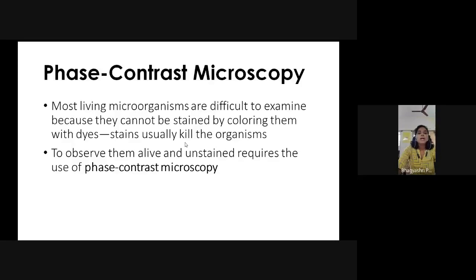In gram staining, the primary stain used is crystal violet, right? The procedure goes like this: first heat fix the culture on the slide, then apply your primary stain, and allow the primary stain to react with the organisms for some time. But if you apply more and more crystal violet, it turns toxic for the cell.